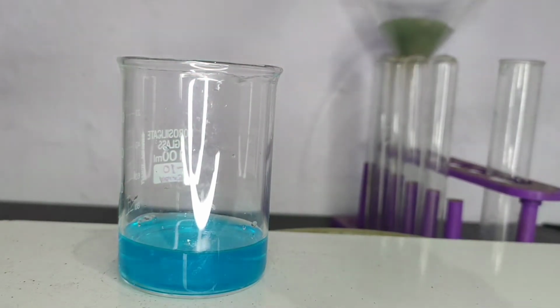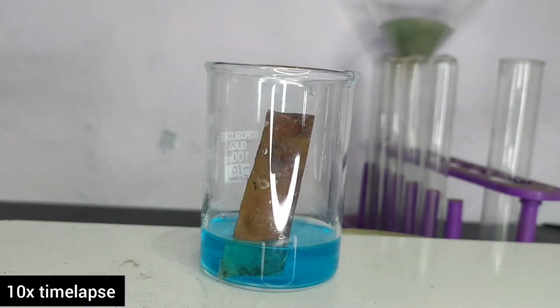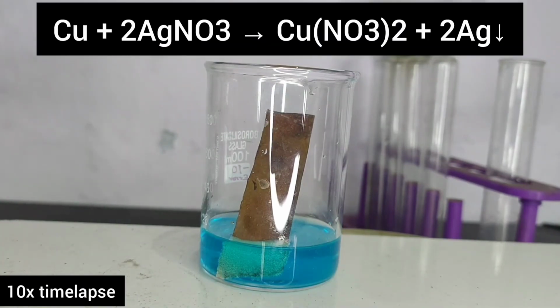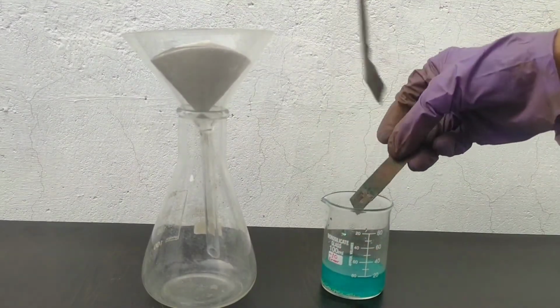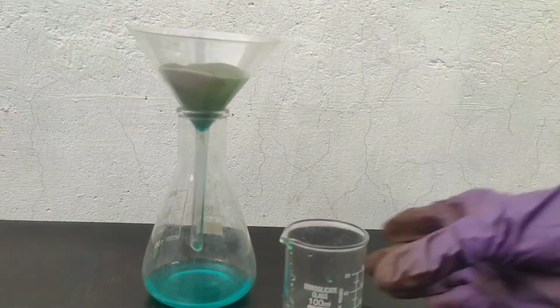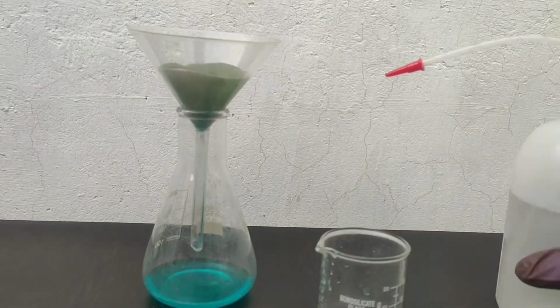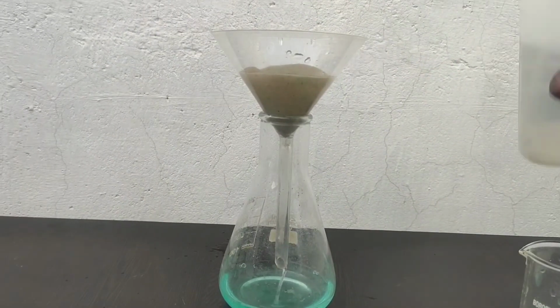And a plate of copper metal was placed inside. What is happening here is copper is displacing silver from silver nitrate solution. You can see the crystals of silver are being formed. After some time, when all the silver was precipitated, I decided to filter off the solution and wash the crystals multiple times with distilled water.